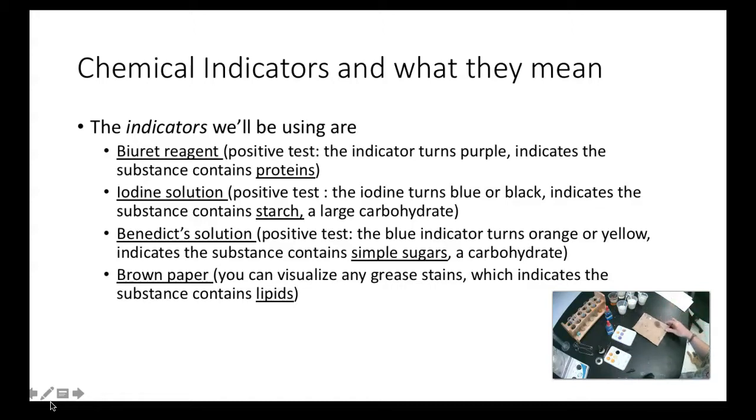The substances that we decided to test include oatmeal. There. How about there? Can you see that? Oatmeal. The light is not the best in this camera, I apologize. This is milk. This is our unknown, our X factor. We don't know what this liquid is.